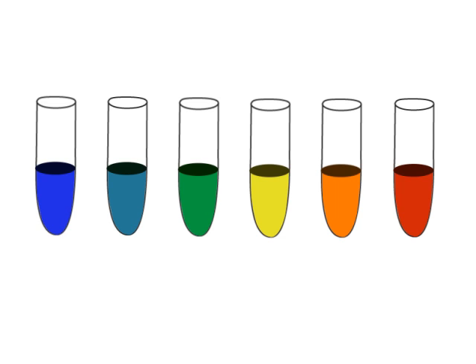If there are no reducing sugars in the test substance to reduce copper-2 to copper-1, the solution stays blue, the color of copper-2. A trace amount turns the solution blue-green. A small amount turns the solution green. A medium amount turns the solution yellow. A medium-high amount turns the solution orange. And a high amount turns the solution rust red.